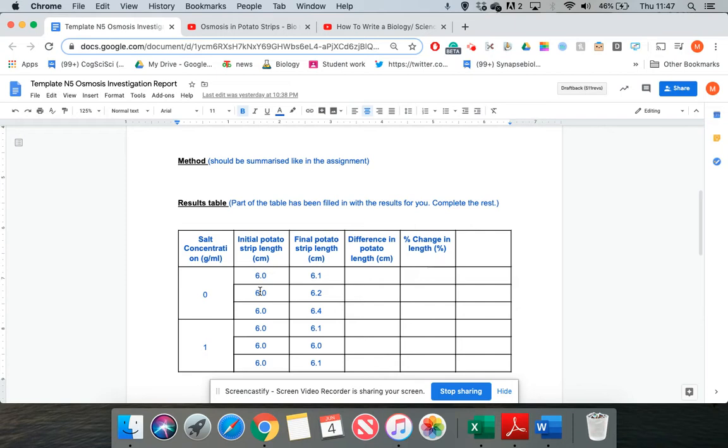This experiment relies on you knowing theory from National 5 Biology, Unit 1, Key Area 2, Transport Across Cell Membranes, as this experiment focuses on osmosis in plant tissues, which in this case is potato cylinders. You should already know what osmosis is, but if you need a reminder, please go back and watch the lessons on Unit 1, Key Area 2 to refresh your memory.